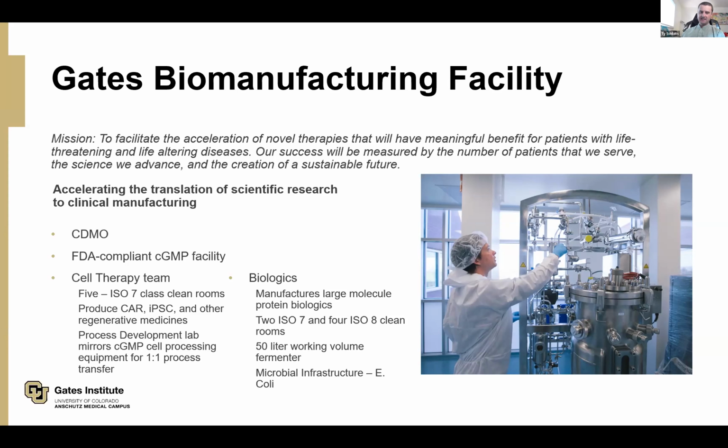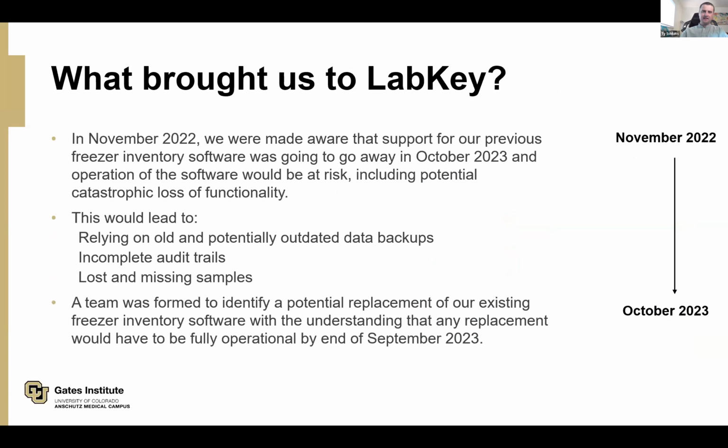Our biologics team works with E. coli, and you can see in this image their 50-liter working volume fermenter, used to produce large molecule protein biologics, things like insulin. I am a part of the cell therapy team, just a heads up there.